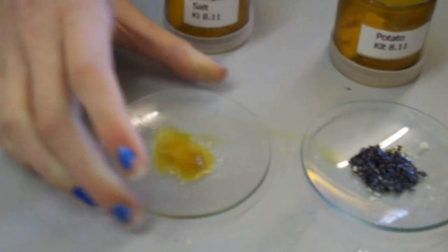If the food goes black, it has starch in it. If it stays the same, it doesn't.